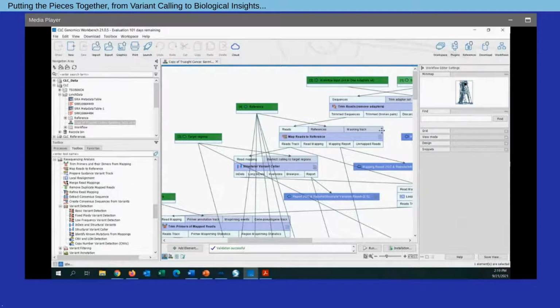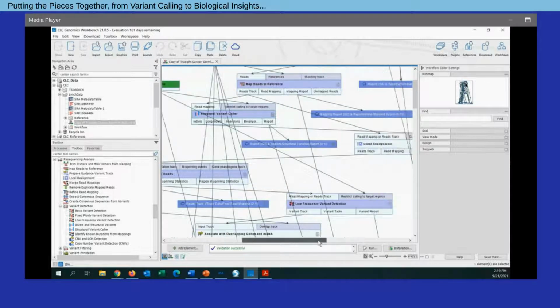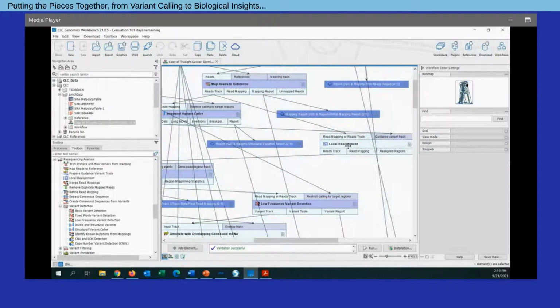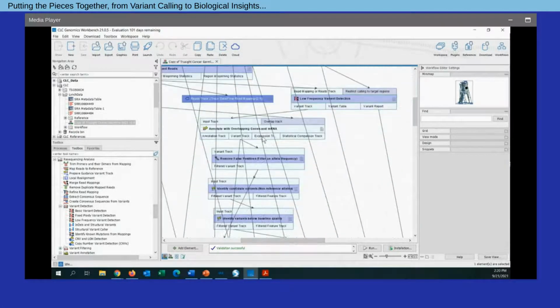Now, to quickly review what's going on in my workflow for today, we have initial trimming steps that we do. We have mapping steps for the alignment. There will then be various steps here that we do to refine the alignment. So we'll do structural variant calling, a local realignment. And then from there, we'll transition into a variant detection step. Now, everything that we would do downstream of here would essentially relate to various tools that are in place to both annotate and filter your variants, such that when we get to our set of called variants as a result of this workflow, we have accurate data being reported.